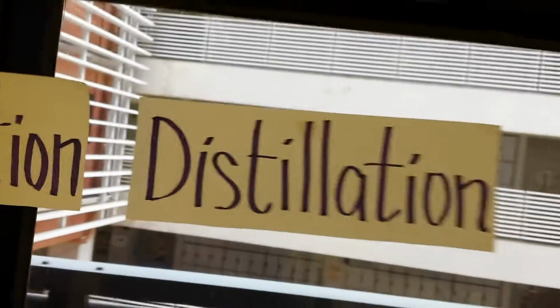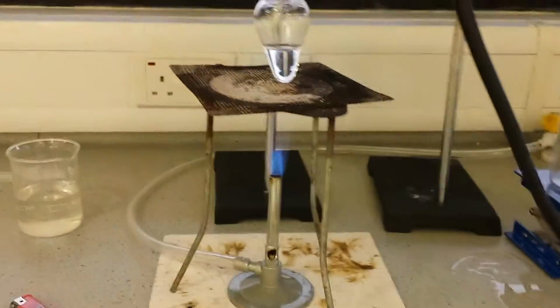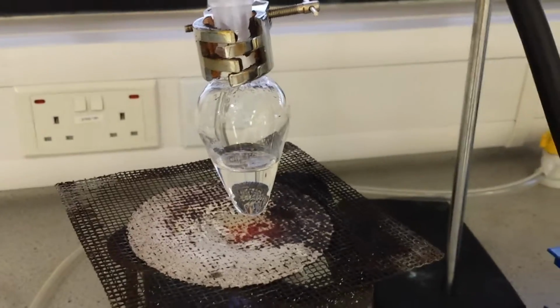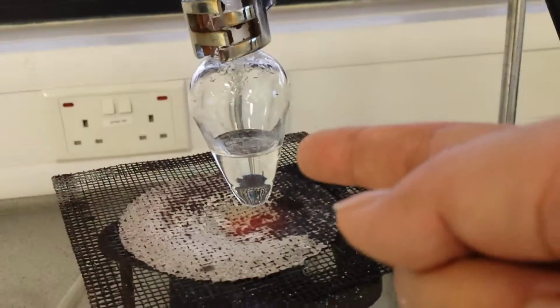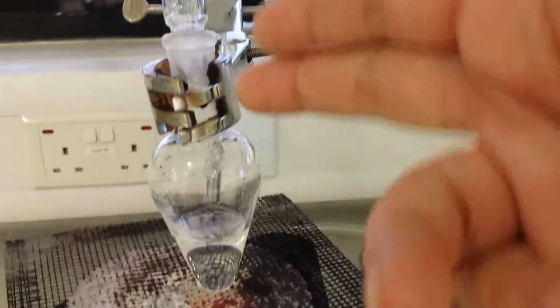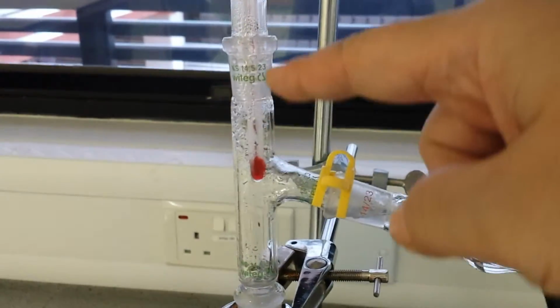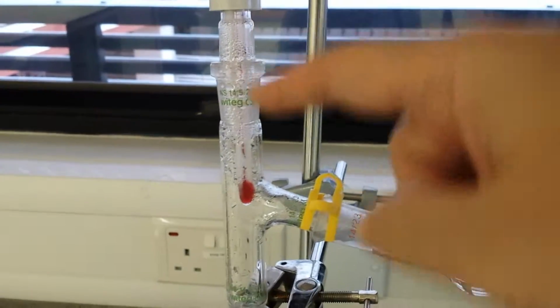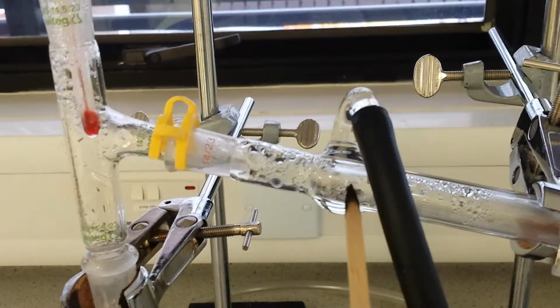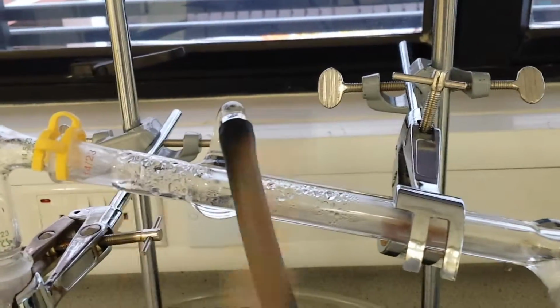So what we have here is a distillation setup, and you can see that we are heating up the water. We have a Bunsen burner and we have salt water over here. What's going to happen is when the salt water boils, the steam will go up this tube over here. But since there's nowhere for the steam to go, because this is capped, the only place the steam can go to is through this tube. And this is called the condensing tube.